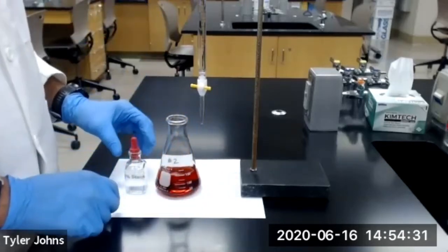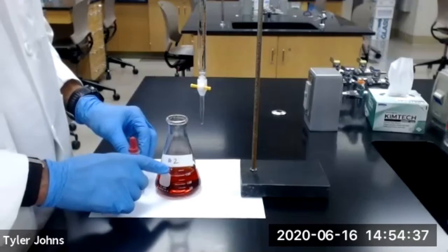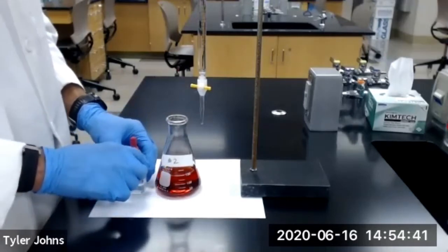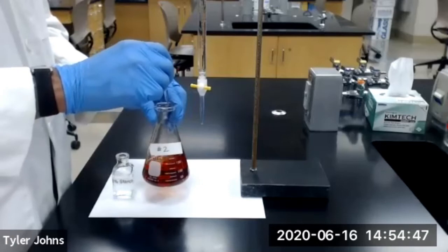We're now going to dropwise add 1 milliliter of our starch solution to the titration flask for trial number 2 until the mixture develops a dark blue color. Remember to do this dropwise.